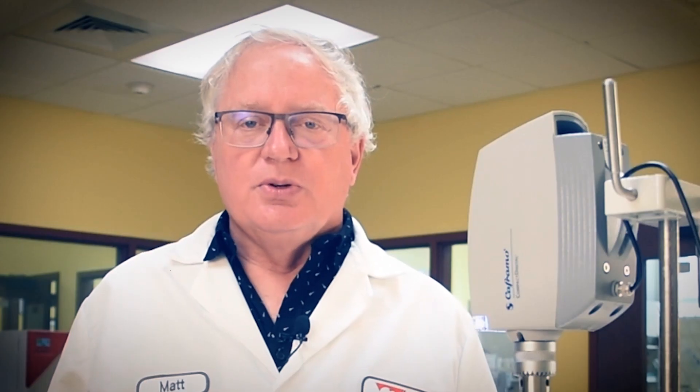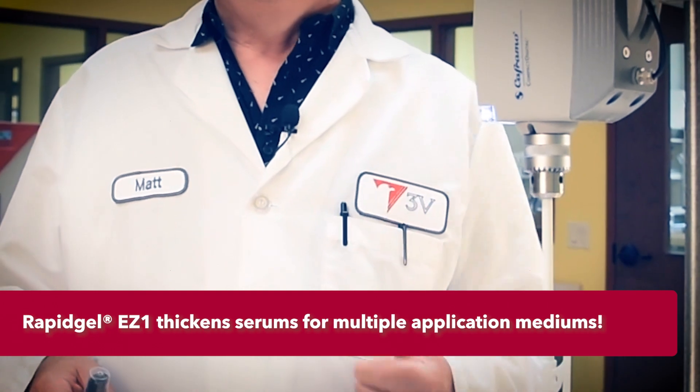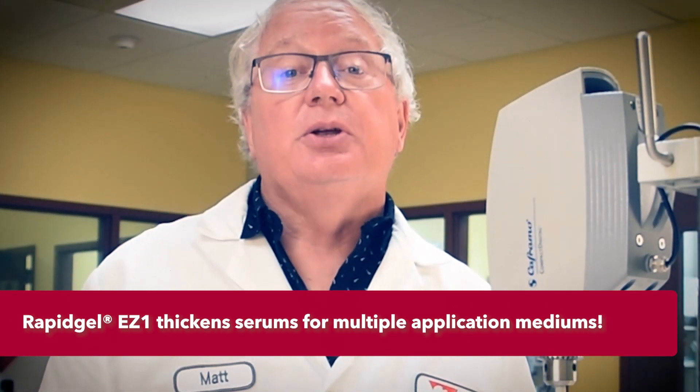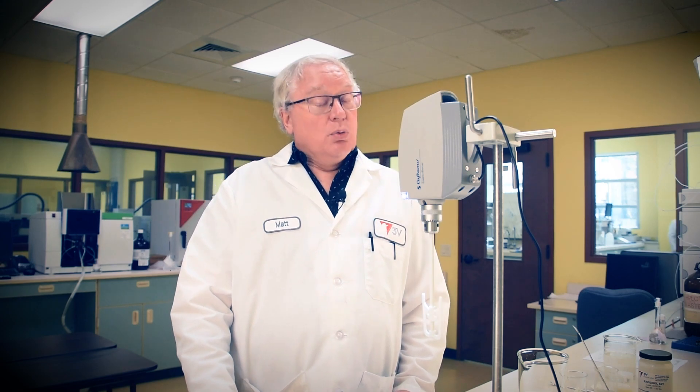Rapigel EZ-1 gels this serum into a safer, more directed medium for facial application than lower viscosity serums, while providing a nice sensorial feel onto the skin. The modest viscosity allows for packaging into bottles with dispensing caps or pumps, both readily available packaging mediums. Our fragrance-free formula also meets drug monograph criteria for an acne treatment with salicylic acid at 2%.